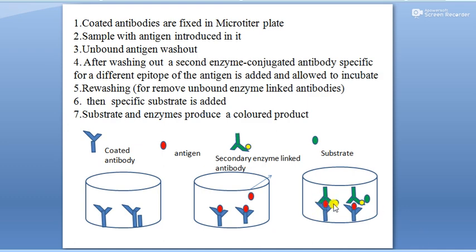They only bind with different epitopes of the antigens, not the same epitope. After incubation time, then a specific substrate is added.